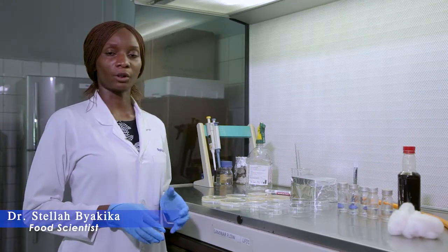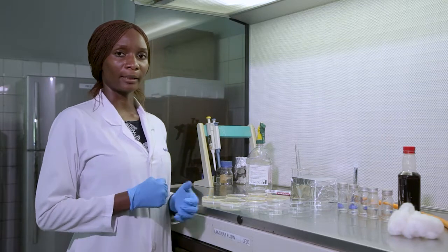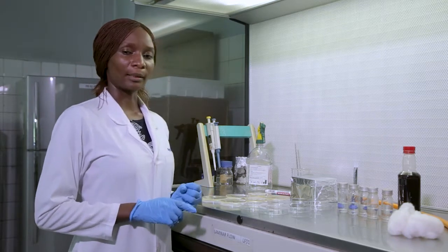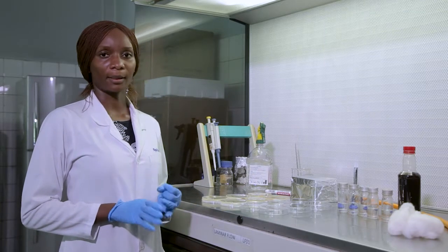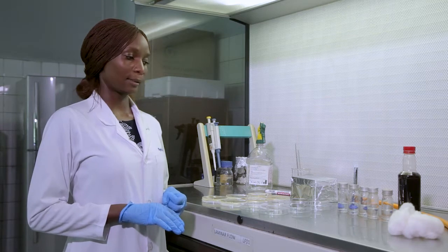Today I'm going to demonstrate to you how to analyze for microorganisms in a food sample, particularly a liquid sample. I'll also demonstrate two techniques, that is the pour plate technique and the surface spread technique. Some people call it spread plating technique.